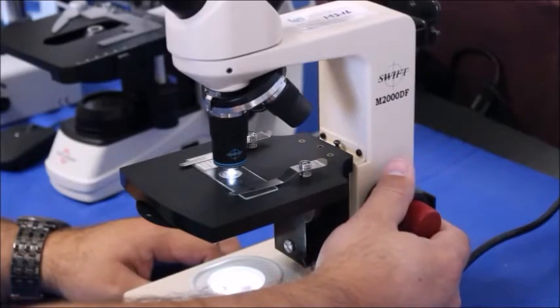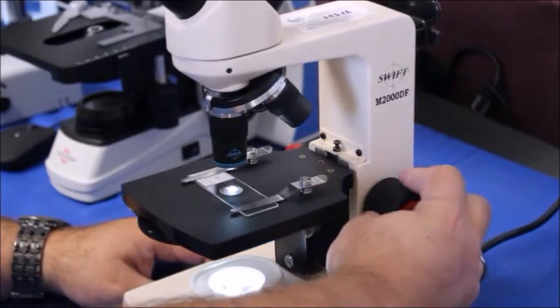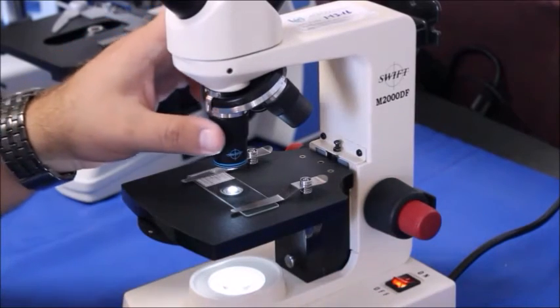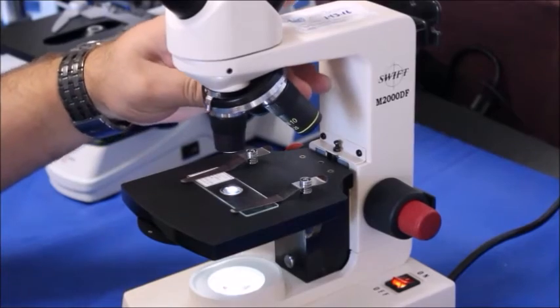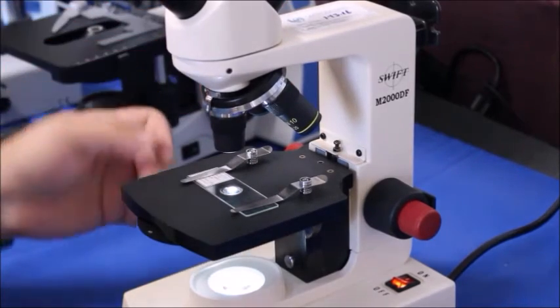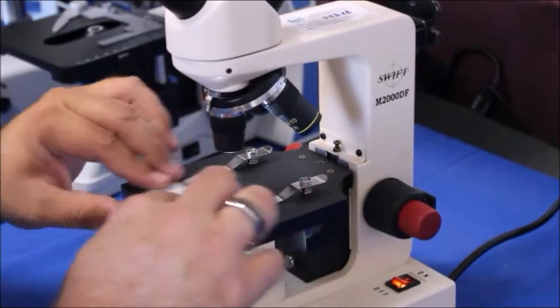Once you're done, you want to take the stage all the way back down by using the coarse focus again. We're going to return it to what we call first position, move it back to the 4x objective, because again it's farthest away, it's out of the way, so that way you can remove your slide.